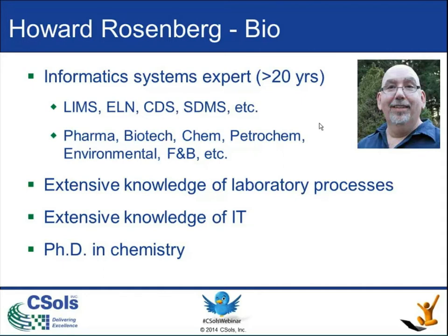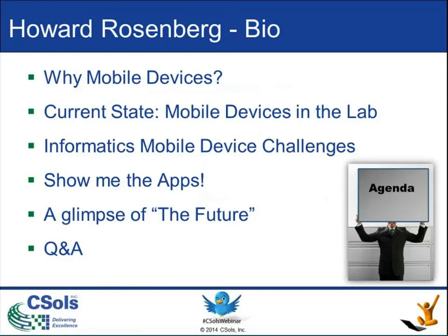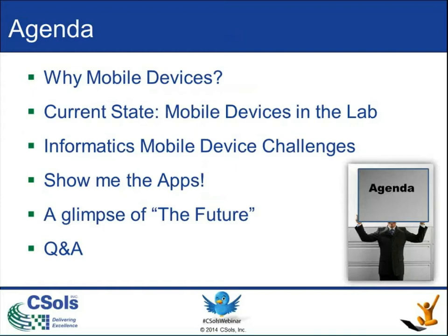So that's a little bit about me, so you have an understanding of where my views come from and what my background is. So without further ado, let's take a look at what we're going to be seeing today. Again, we're talking about mobile devices in the laboratory and beyond. The first thing I want to go over is why people use mobile devices and what we're defining as mobile devices for today's talk, as well as where and how they're being used. We'll take a look at the current state of mobile device use in the laboratory and outside in the field, where we all are at, as well as some of the challenges facing informatics use in that space.